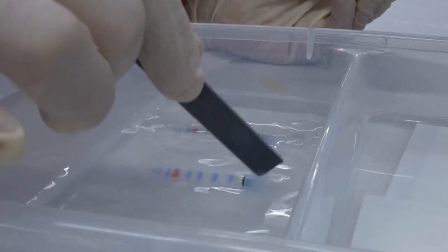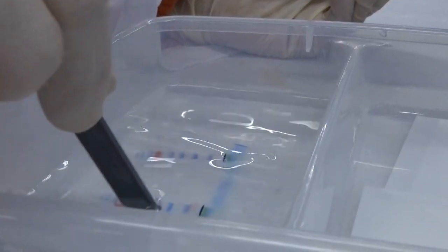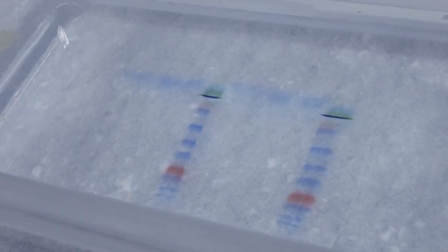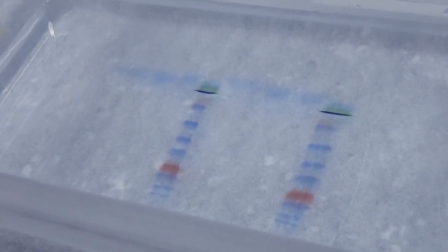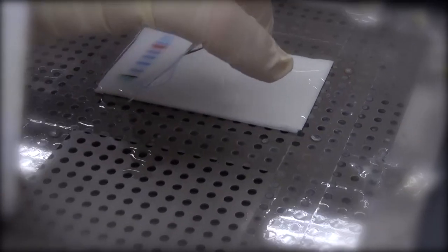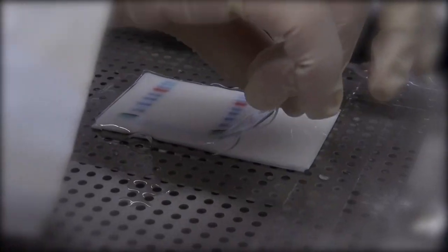In case the gel folds up after being peeled off, you may use a spacer to unfold it. If the samples will be used for sequencing or mass spectrum analysis, soak the gel for 10 minutes to remove SDS. Otherwise, continue to the stacking step without soaking.